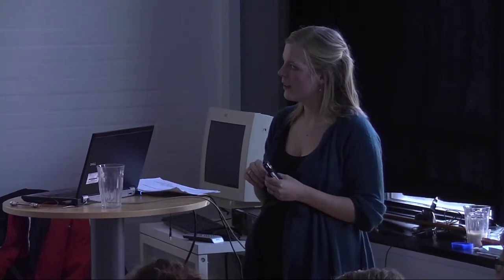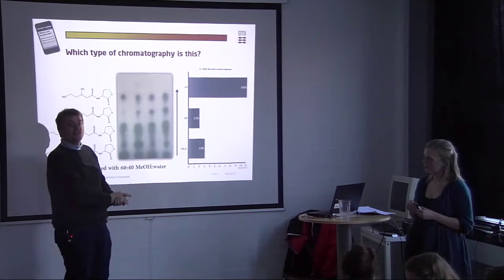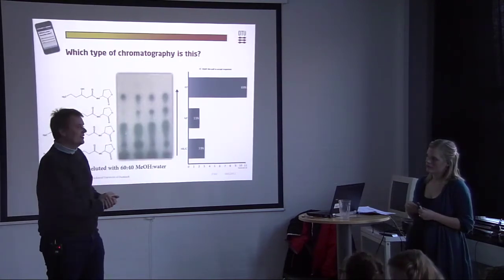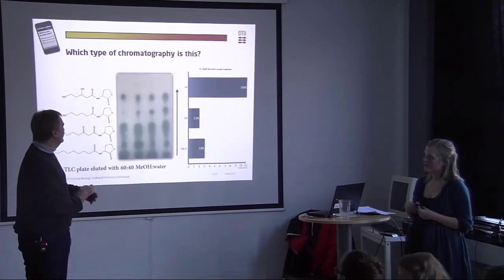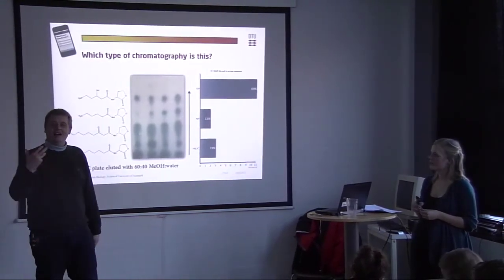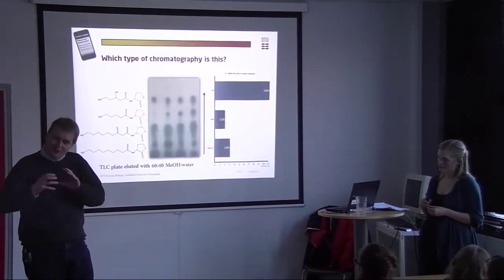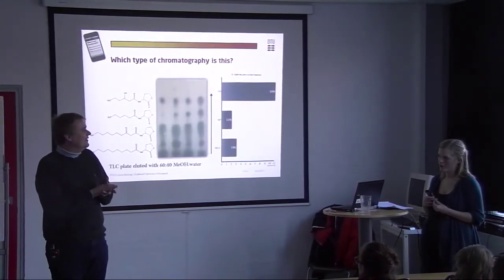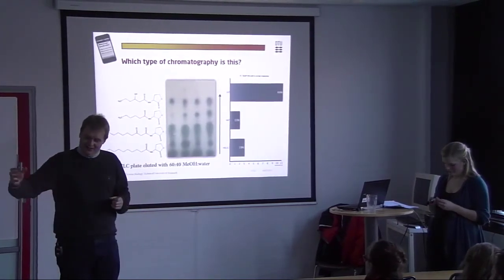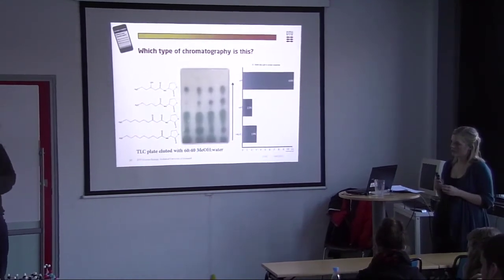This is also a good example, for the ones who know what happened here, is that we added the compounds. And then you dry the TLC plate. If you don't dry it, then it doesn't work, because it will kill the bacteria after that. Then you have the TLC plate, and we then have an agar at 50 degrees. That's when it's almost starting to solidify. And then you have a bacteria that can produce this blue color.